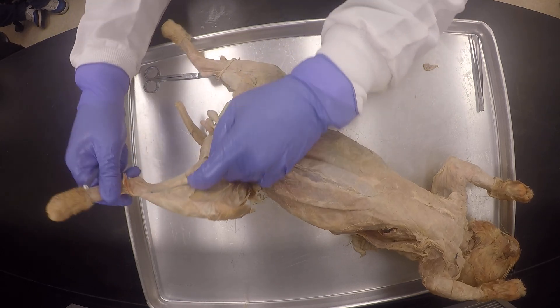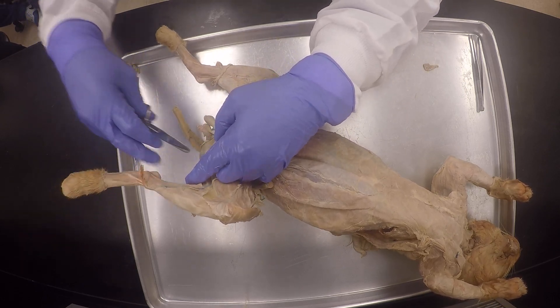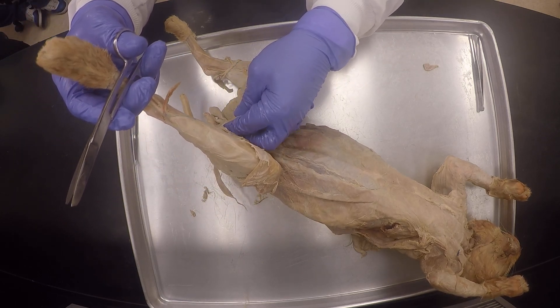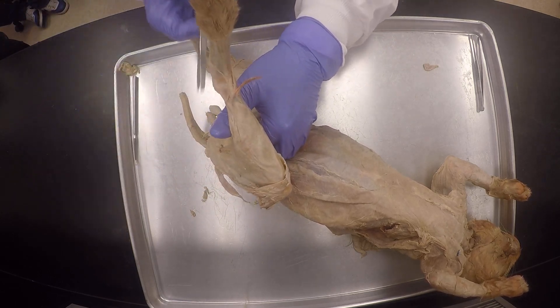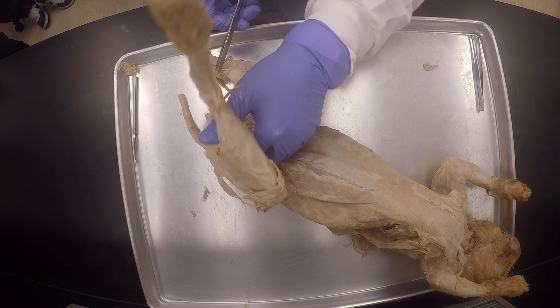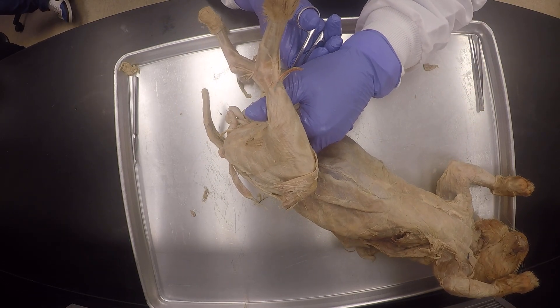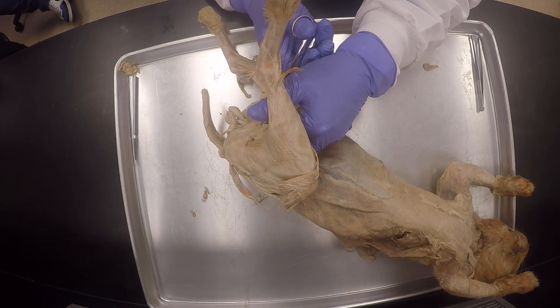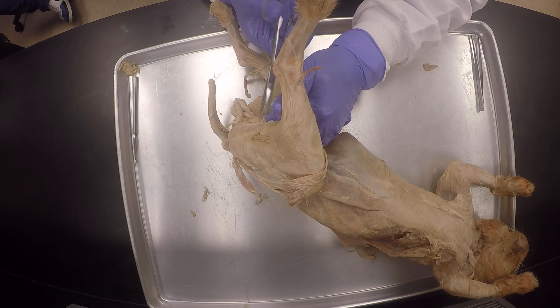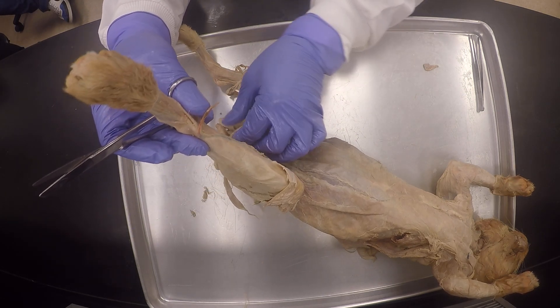Do you see here? This is not supposed to be like this. This is supposed to be one continuous muscle. Do you see that, my good friends? I zoom in to the camera so you can see.